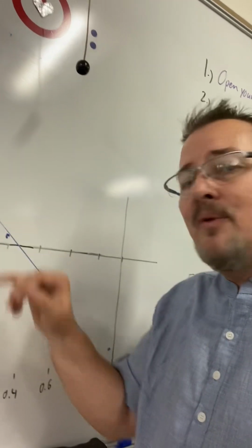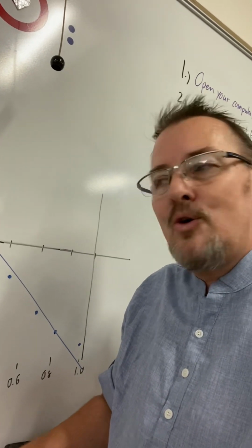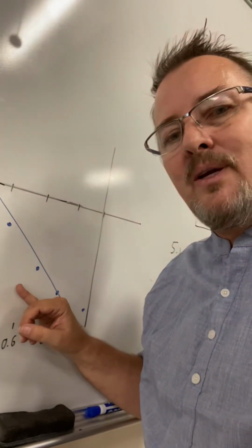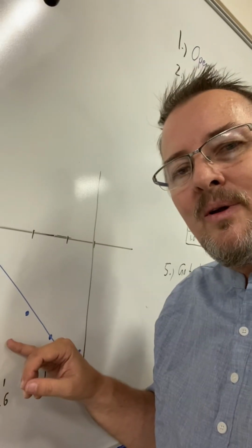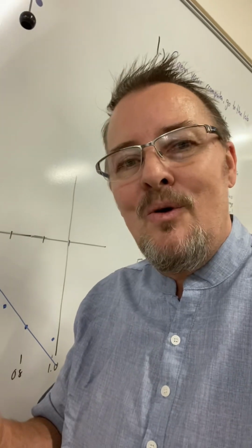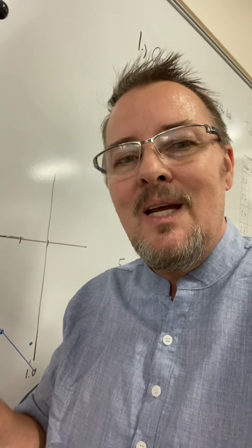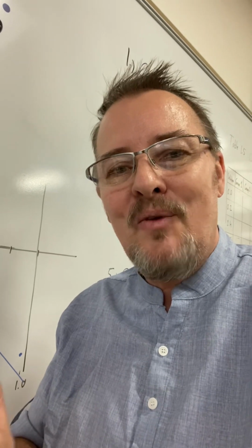So when we look above, we know that when the potato cores gained mass, that means water went in. So osmosis went from the beaker into the cell. But if we look at these numbers down here, we have the opposite movement. So water went from the potato core into the beaker, and the potato core lost water. Now, what do we call that when the potato core and the solution it's in have the same concentration and there's no net movement of water going in or out? Pause here, discuss it with your friends what that's called, and then click on play again.